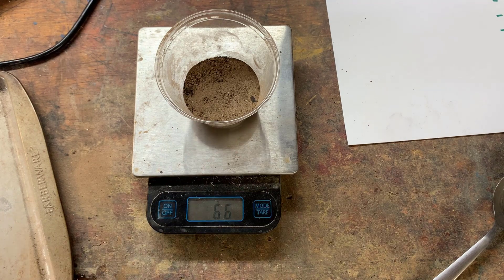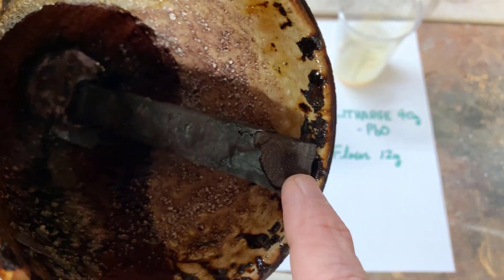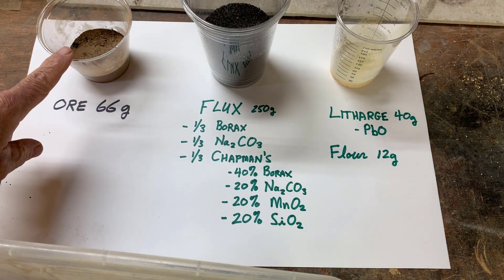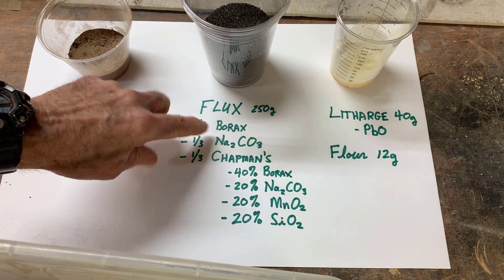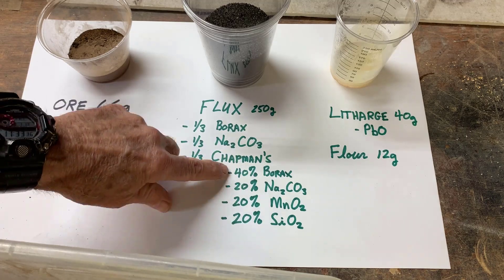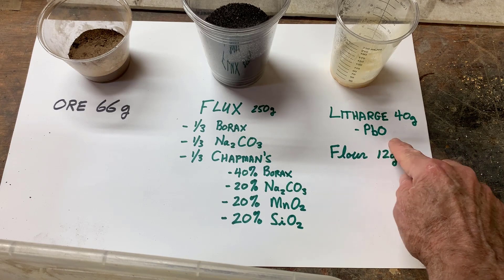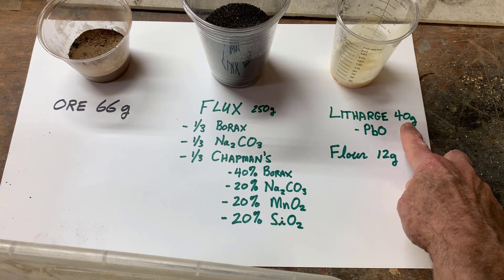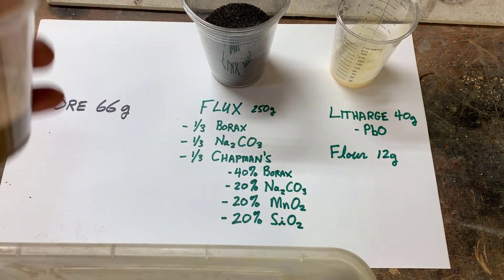Now I'm going to mix the charge for smelting. Here's the charge going into the crucible. The crucible has an iron rod that helps to reduce the litharge, and I found it's quite important. So: 66 grams of ore, 250 grams of flux — that flux is composed of one-third borax, one-third soda ash, one-third Chapman's flux. And then, as a gathering metal, we've got litharge, which is lead oxide, and 12 grams of flour. I use 40 grams of litharge because I've got Mabor cupels, and they can hold 35 grams of reduced lead, which is about what we'll get out of this smelt.